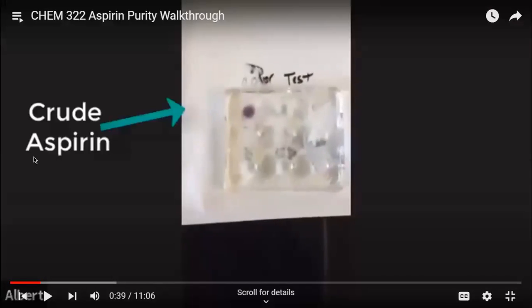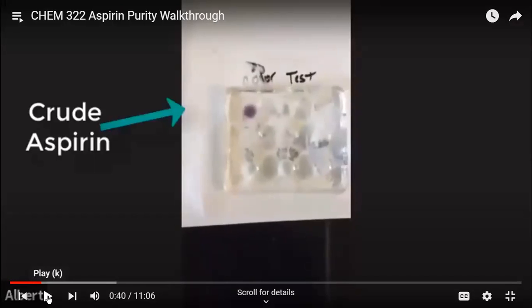The crude aspirin is the aspirin that was not purified. That's what it means when you hear a sample is crude: it hasn't been purified. Let me see if I can get a better frame. You can see right there, when you add that iron chloride to that crude aspirin, it looks like grape Kool-Aid. That's bad. What that means is that there's a lot of salicylic acid left over. That's why you have to recrystallize the aspirin to get rid of all the impurities.